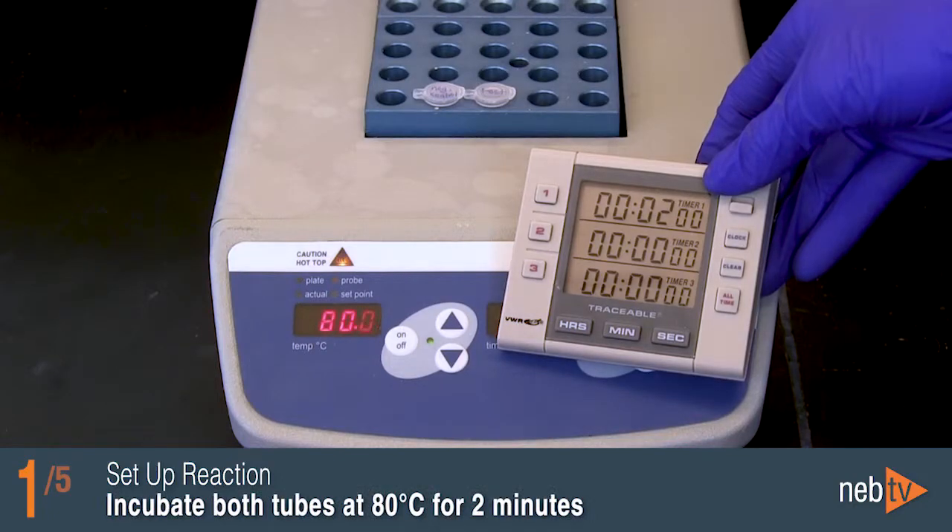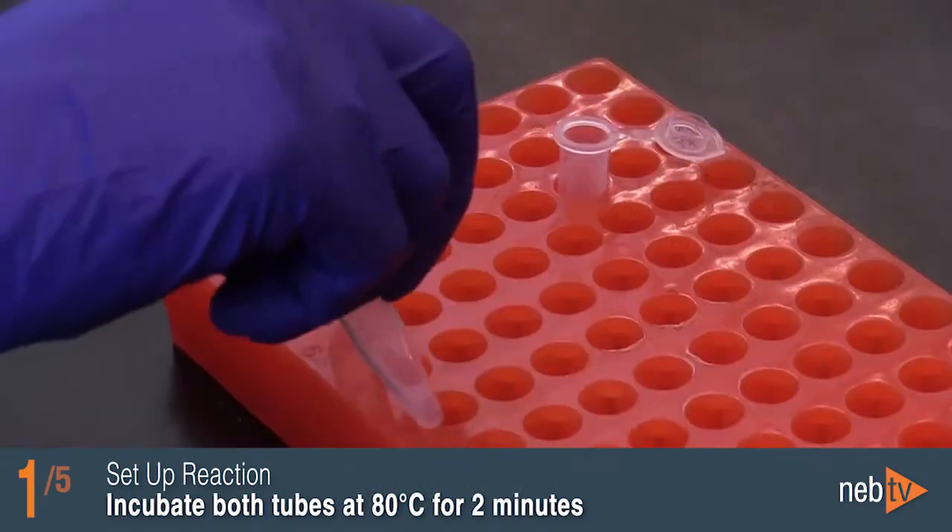Incubate both tubes at 80 degrees Celsius for 2 minutes, then cool to room temperature.